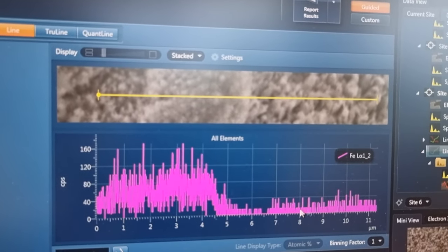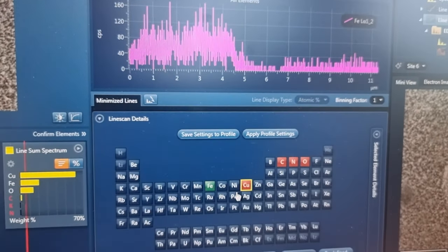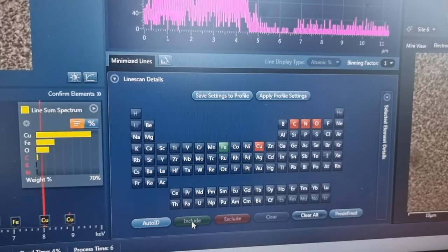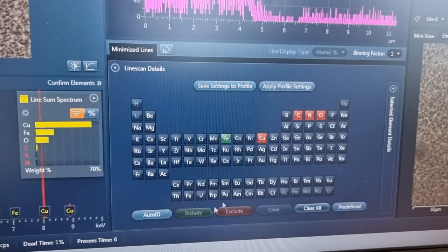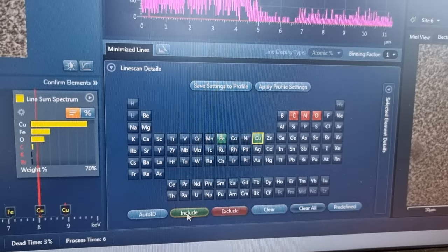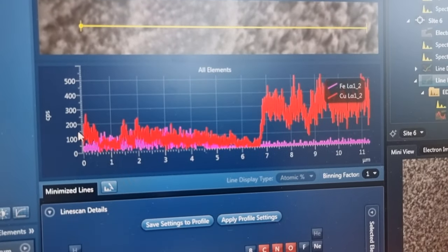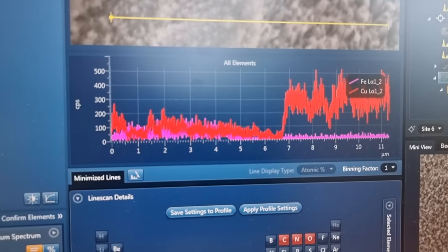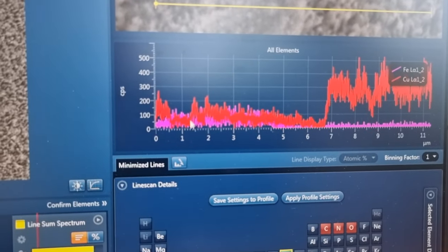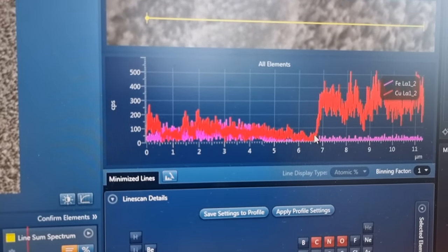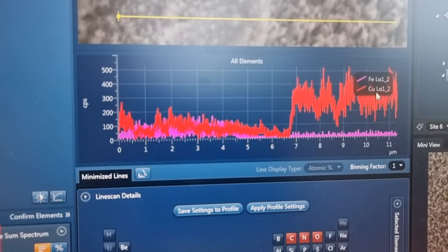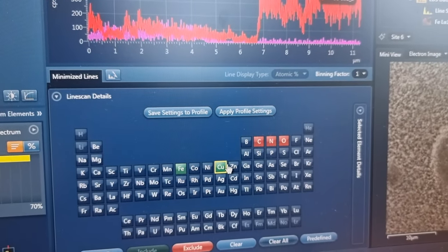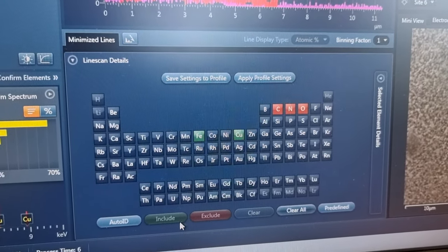Now if I turn on the copper here, I'll include that. You'll see that the copper is higher when it's on the inside, drops down to a very low level, and then pumps up to quite a high level. Let's see what happens when we do that with, say, oxygen.